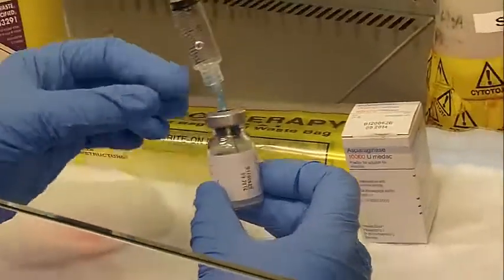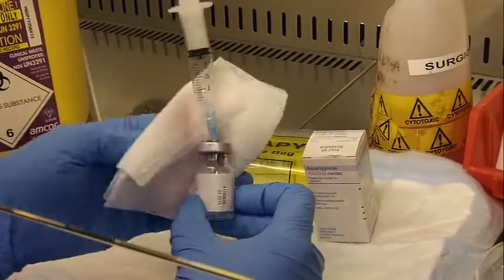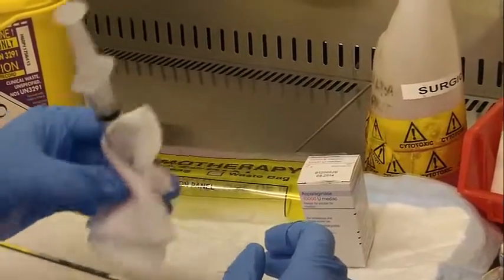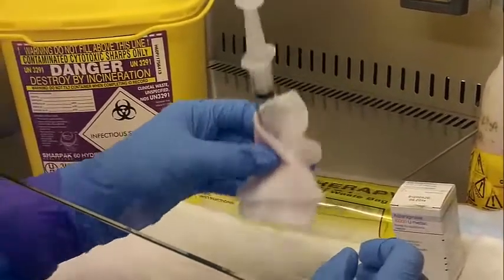I'll leave the needle and syringe in place, because if I pull that out, there is a risk that little aerosols will come out with it. So I leave it all in place, I'll wrap my swab around, and then I'll gently mix the solution until I see that all the powder's dissolved.